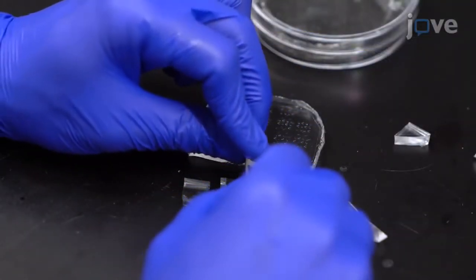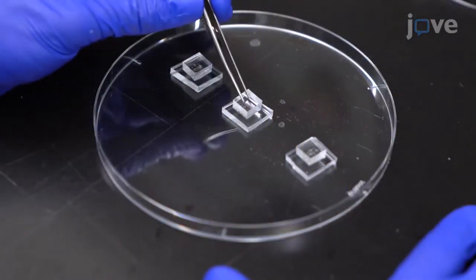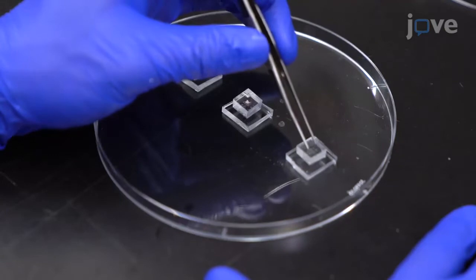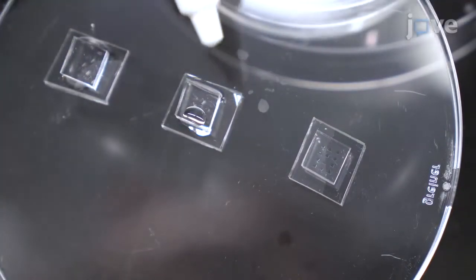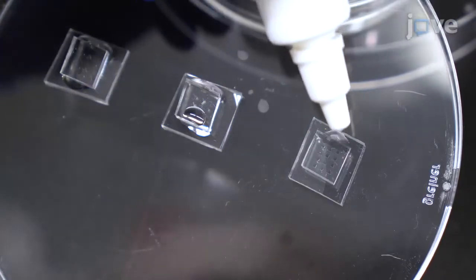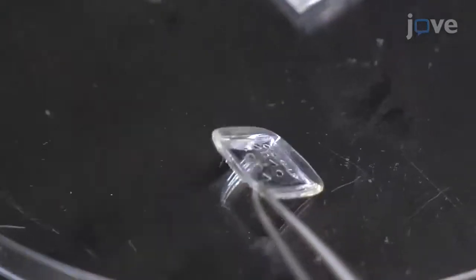When performing this protocol for the first time, be sure to generate a few extra of every material and use a fluorescent ligand so that you can troubleshoot and optimize at each step. This technique involves multiple steps that involve the precise positioning of various materials. It's much easier to understand the written instructions for this protocol once you've seen it performed.